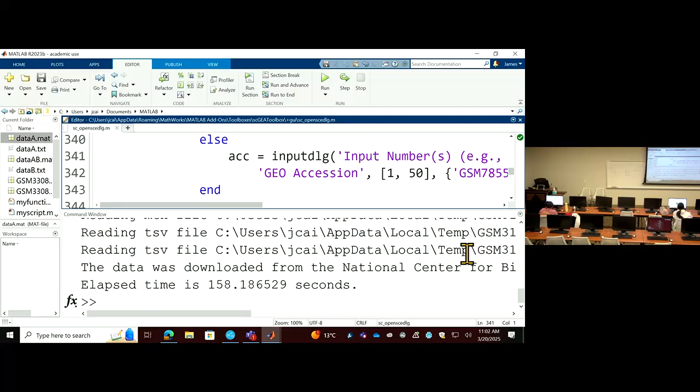Oh, there's another way. Let me show you. What you can do is delete the path here, so it does not point to the old one. From here it was giving me that option to remove. Where is yours? Maybe from here?